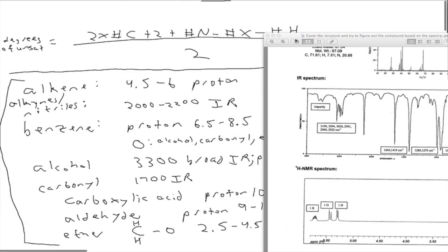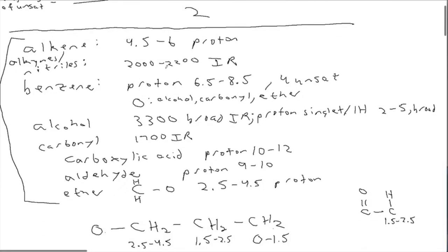Okay, so to wrap up, I think we've seen how some of this information can be helpful to you. It's important to be able to recognize. You were asking whether you should memorize this. Maybe it is worth memorizing a lot of this, just so it's easier to access. It's easy to see when there's an alkene because of these peaks. Triple bonds are easy to detect because of these. Benzene is easy to detect because of this peak. Alcohols are pretty obvious here. Carbonyls are pretty clear.